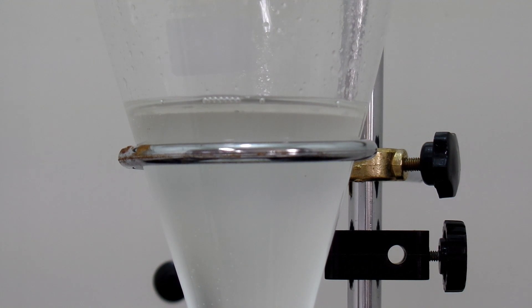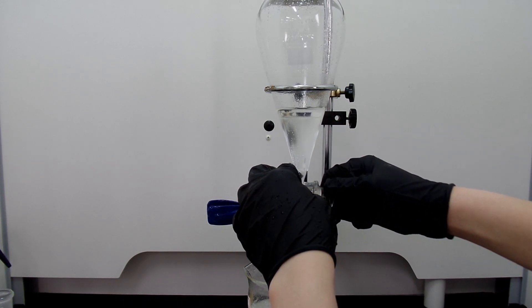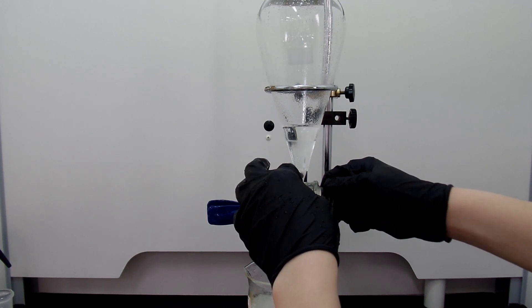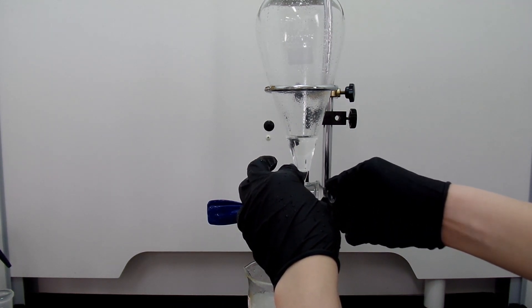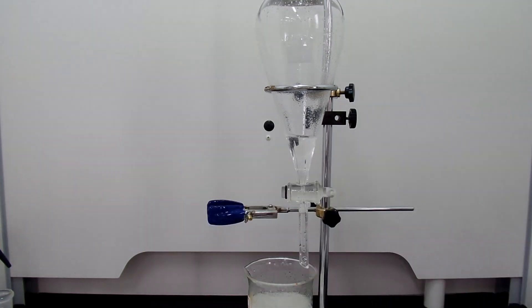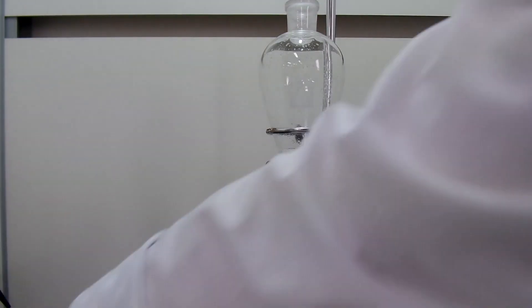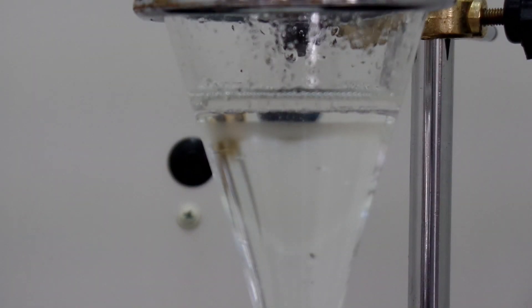After letting the layers settle, the bottom aqueous layer is discarded. Then add saturated sodium chloride solution. This is to pull out water in the organic layer. Shake the separatory funnel, and this aqueous layer is also discarded.